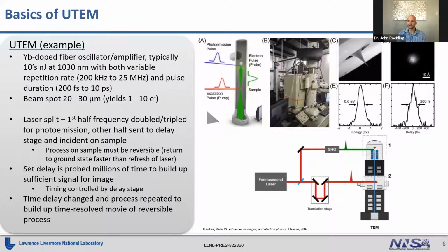And then if you integrate the... having a normal TEM, and the time resolution is very fast. You can get 200 femtosecond pulses out of this instrument.